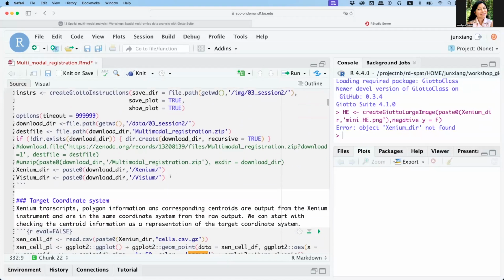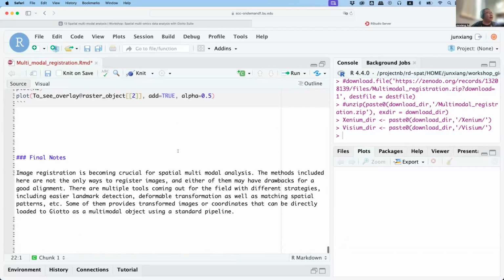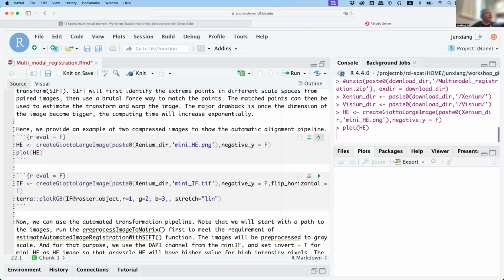Yunshan, you still have around 30 minutes. So if you need to rerun parts of the code, don't worry, you still have time. Okay, yeah, we actually don't have to rerun this because it's a separate part.